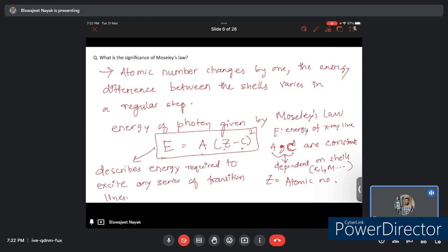So for example, X-ray photons of highest energy in an atom are emitted from the K alpha shell. So this energy is basically equal to the binding energy of the 1s electron, which will be proportional to Z square, and this energy will be different for each element, and hence we are able to identify each unique element having a different atomic number.